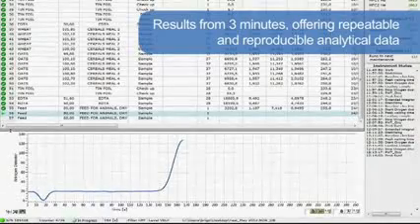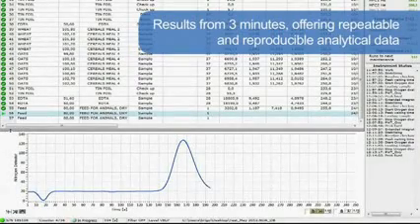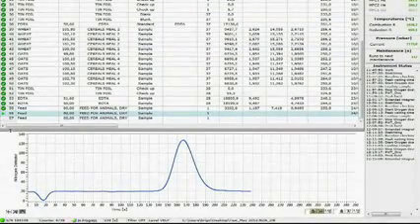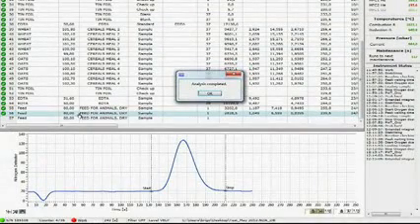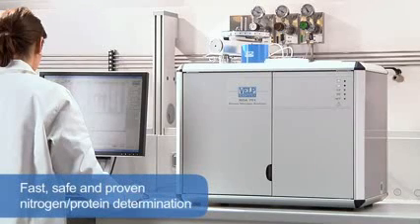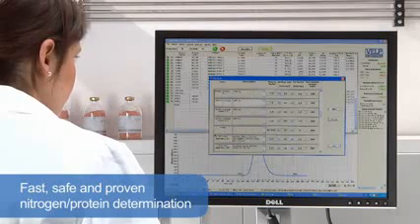The analysis time starts from 3 minutes, offering repeatable and reproducible analytical results on several types of samples with no matrix effect in the determination of nitrogen. To increase the precision and accuracy, all the gases are tested. The NDA701 has no requirement for hazardous chemicals, providing fast, safe and proven nitrogen and protein determination.